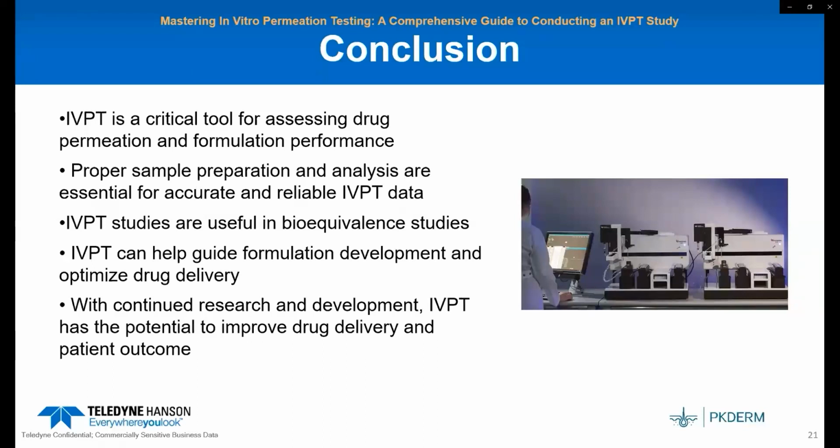This includes quality control of skin samples, careful application of formulation, removal of excess formulation, and separation of each skin compartment.